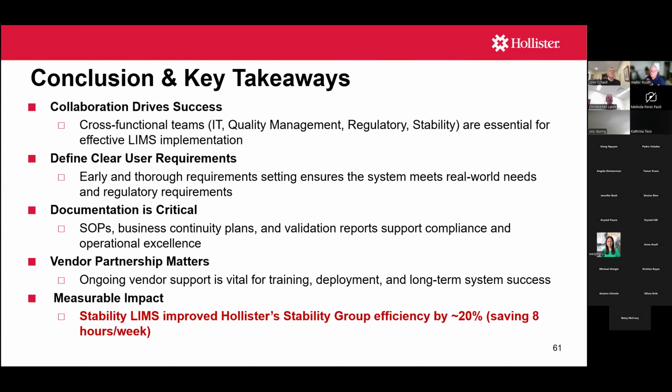Okay. So conclusion and key takeaways from this whole LIMS selection and implementation. Again, you do not want to operate in a vacuum just with your stability group. You need cross-functional teams: IT, regulatory, quality, stability, maybe other folks in R&D in order to ensure success.